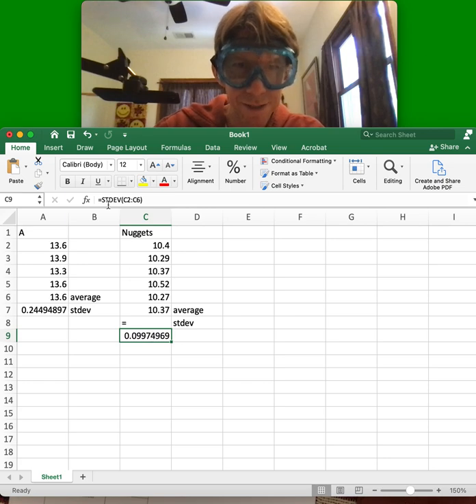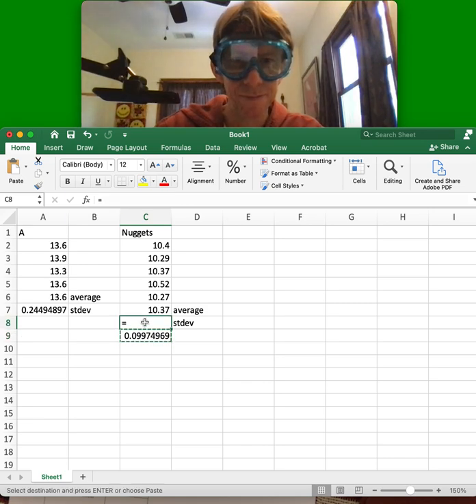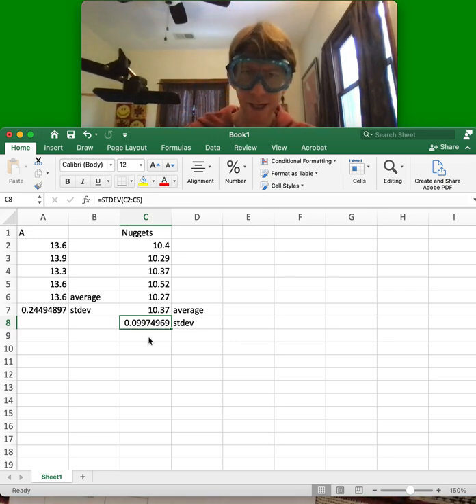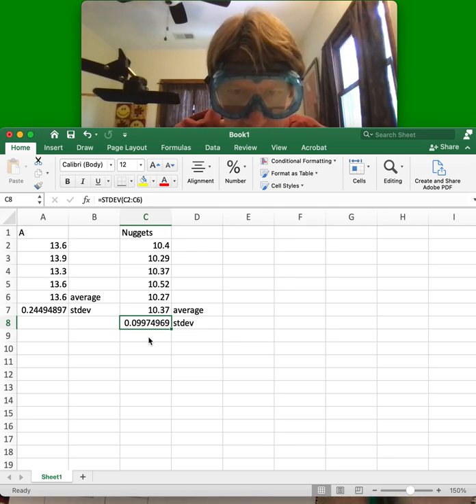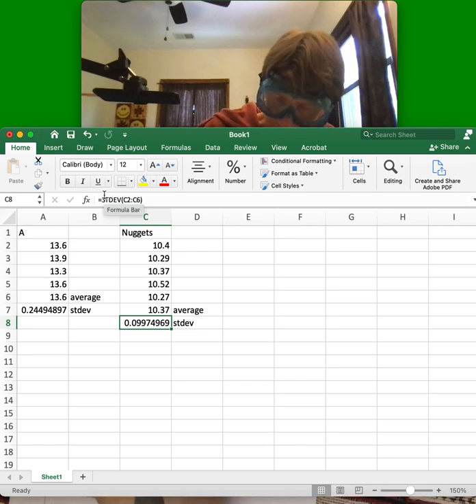I put it in the wrong box, but I can see that my formula is right here. So I'm actually going to cut and paste. Now it's in the right spot. So now I've got 10.37 and 0.09974969. So I'm just going to write them in the box.